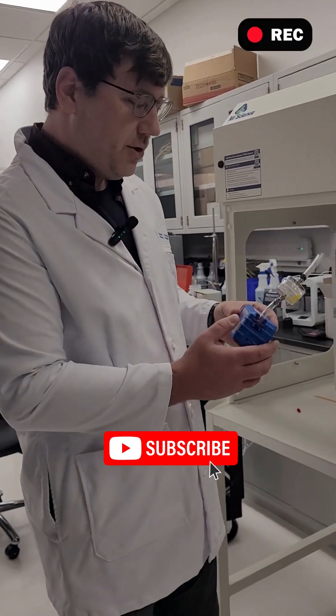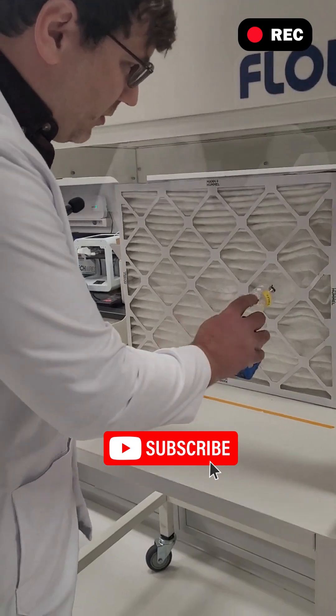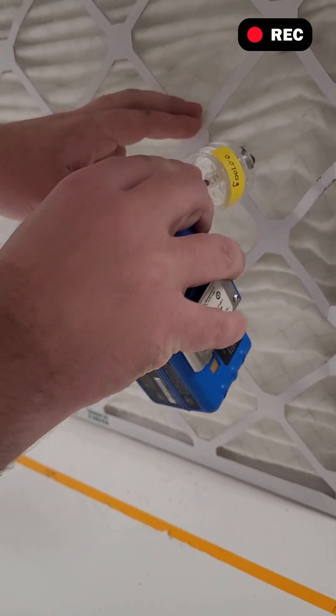So what we're gonna do today is we've got a pump and we've got a loaded filter, and I'm just gonna go through here and vacuum off a small section in which we've already taken an XRF shot.